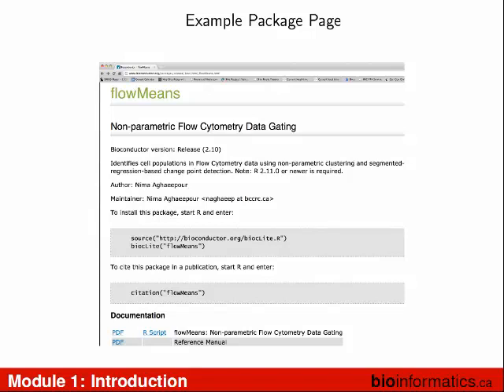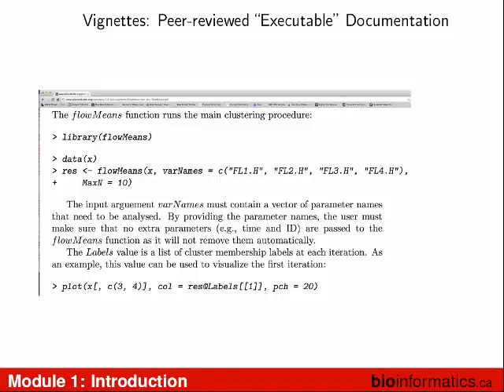It's that simple. So all the packages have some basic examples, documentation, R scripts associated with them. So this is what the vignettes look like. They'll tell you what you do. So this is how you say, I want to use the flowMeans package. Before you do that, R knows nothing about flowMeans, or Bioconductor, or RStudio knows nothing about all these tools that are out there, because there's thousands of them, and it doesn't necessarily have all those thousands loaded up on your computer. So you say, I want to use this package, and now your computer learns how to run that software.